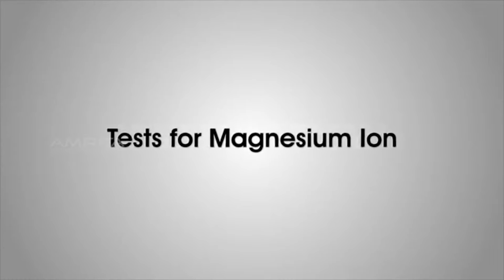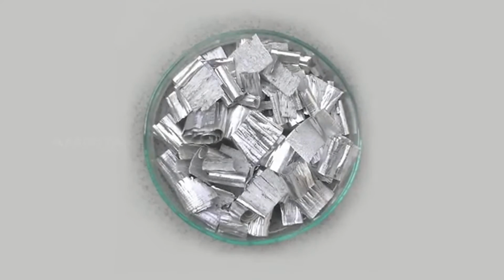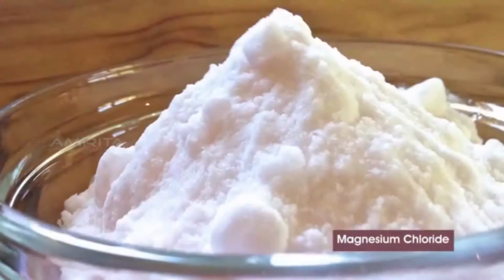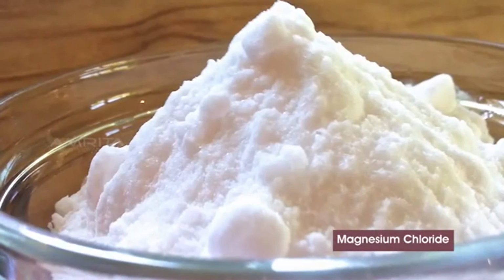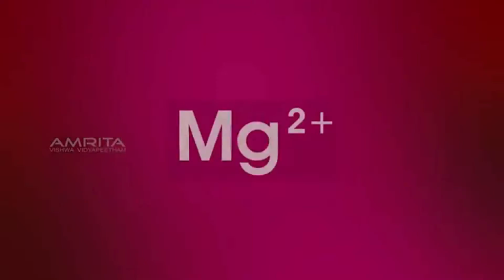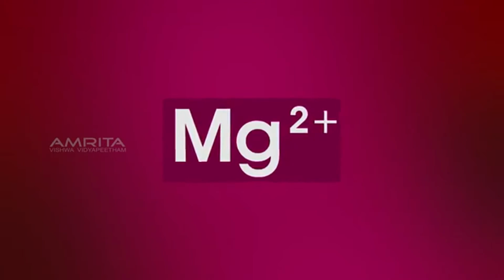Tests for magnesium ion. Magnesium is a chemical element with the symbol Mg. It is found in various salts like magnesium chloride and magnesium sulfate as magnesium 2 positive ion.